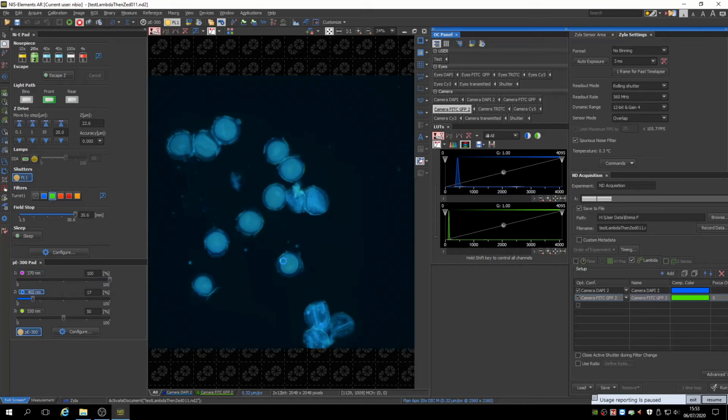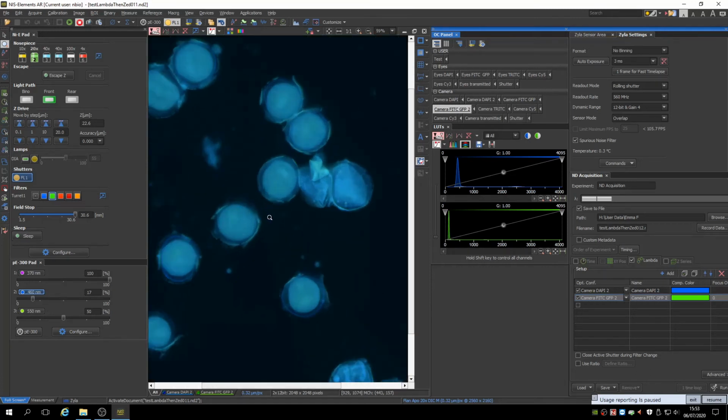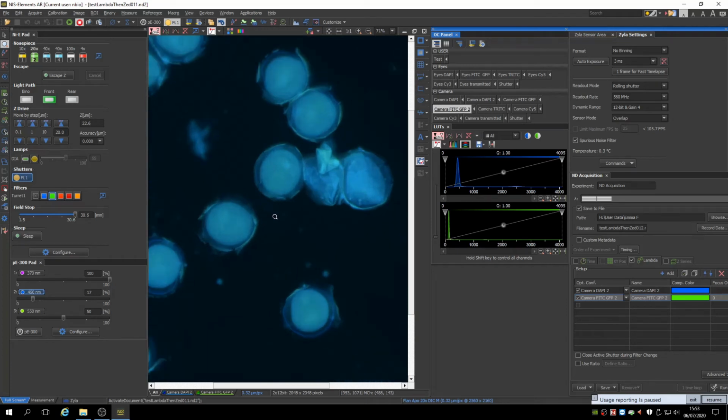The image shown here is an overlay of both channels. It looks turquoise where the autofluorescence of the pollen is being picked up under both the blue and green channels. If you've stained specific areas of your sample, this is where you would expect to see different sections highlighted by their different lookup tables. So you can look at both channels combined, or you can look at them both individually.